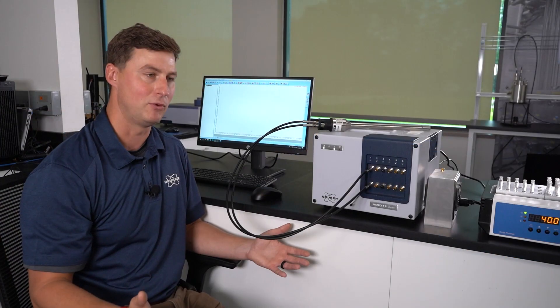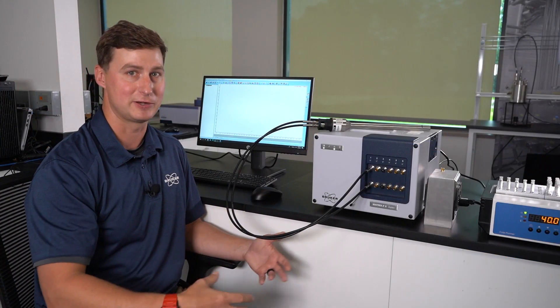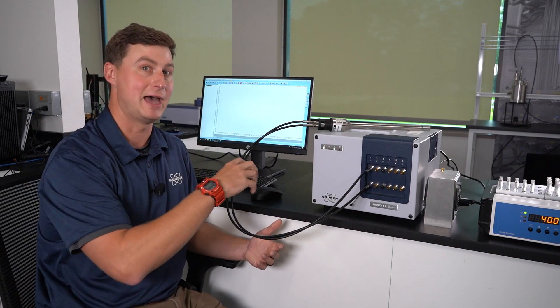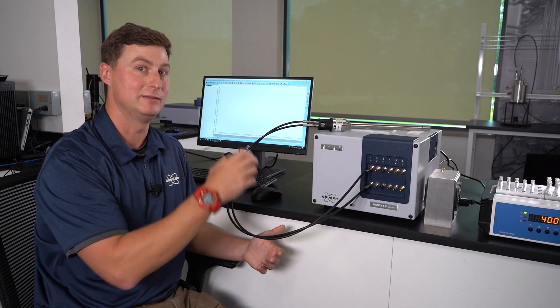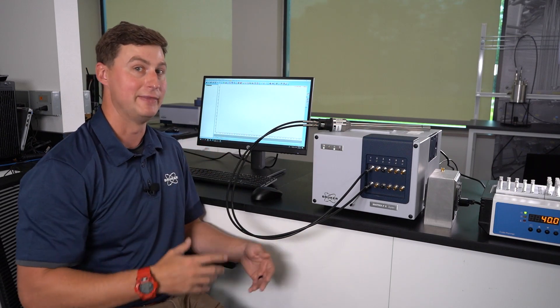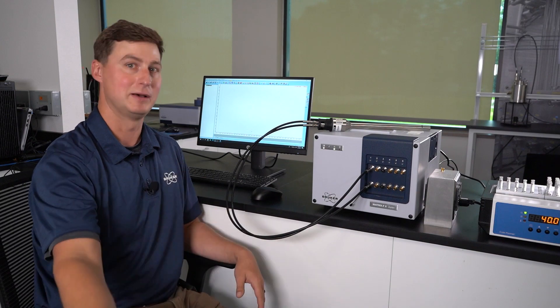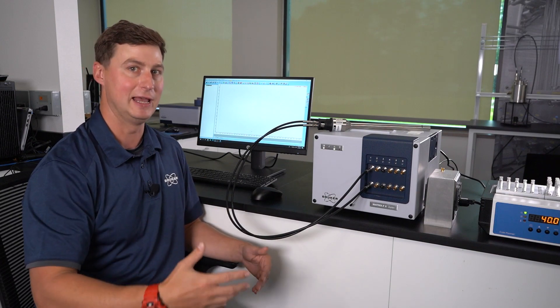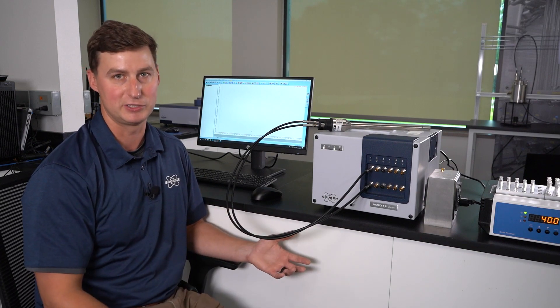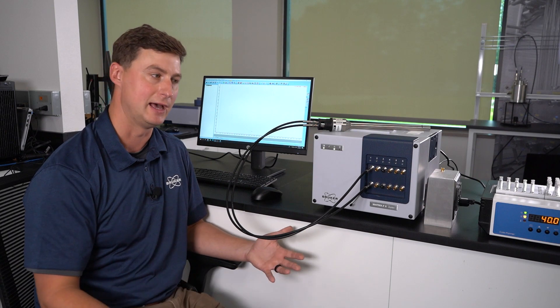At that point, collect data, collect spectra, collect samples, and then add that process data to the benchtop calibration. Once that's modified, we can then apply that and use those modified calibrations for real-time predictions inline.